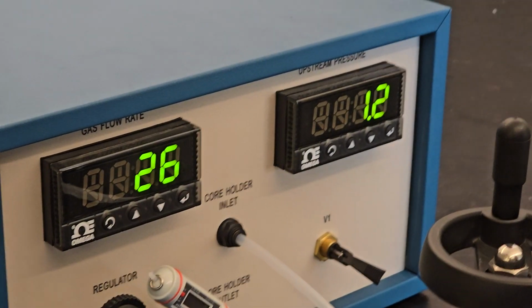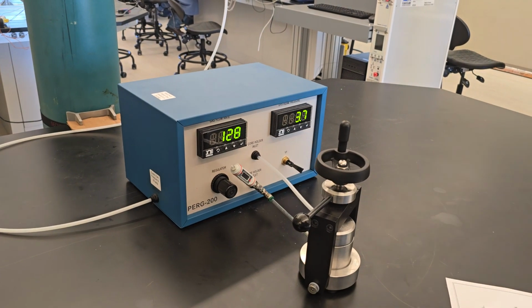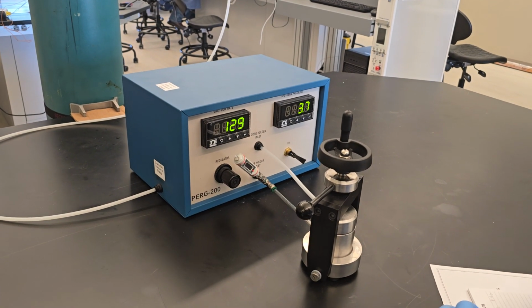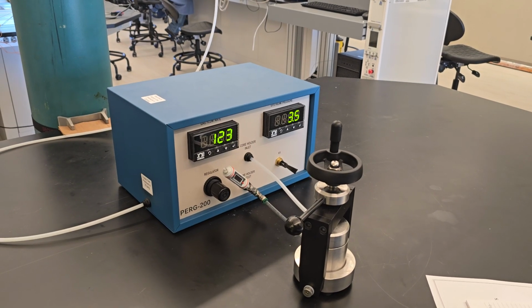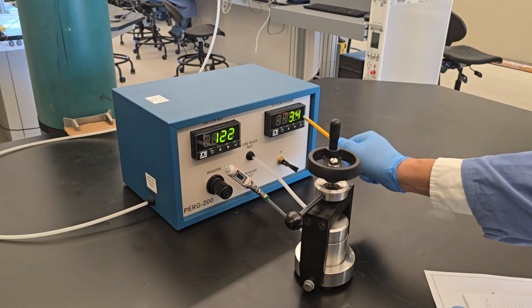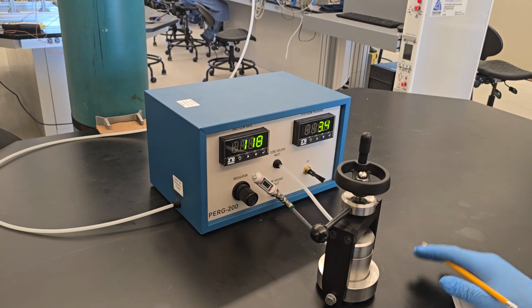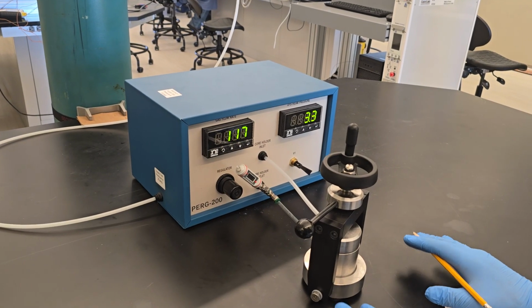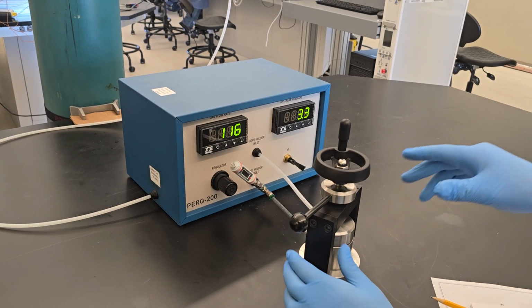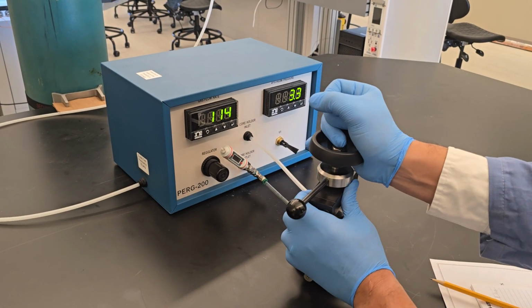Then I'll push it up to a higher pressure. So I got, all right, 3.5. I'll wait. By the time it goes to 3.4, I'll get the reading, but it's not stabilized, so I'll wait a little bit. Okay, now we're kind of developing some stabilization, but that may give me a feeling that there is a leak, so I'll try to tighten this a little more.